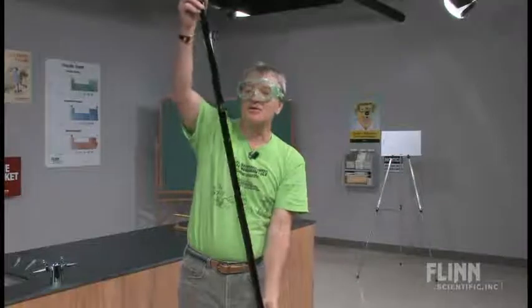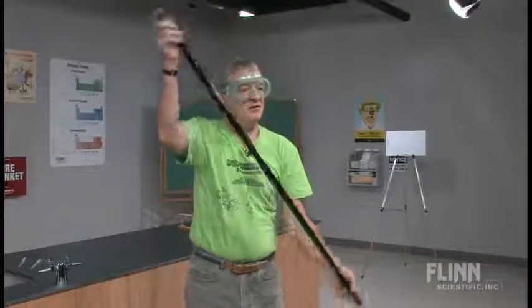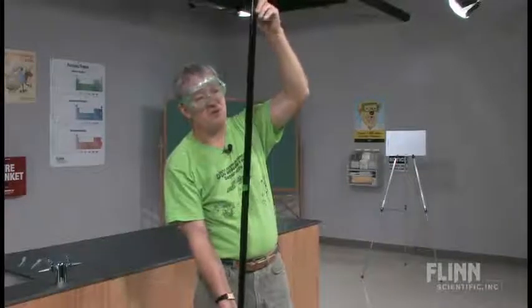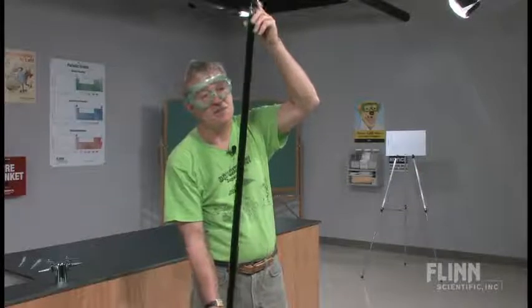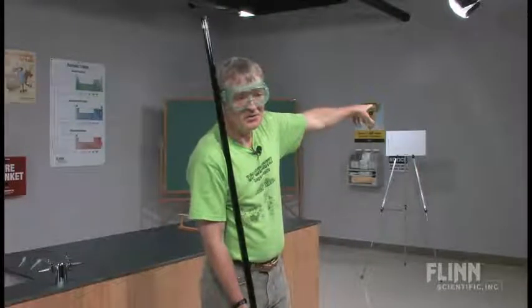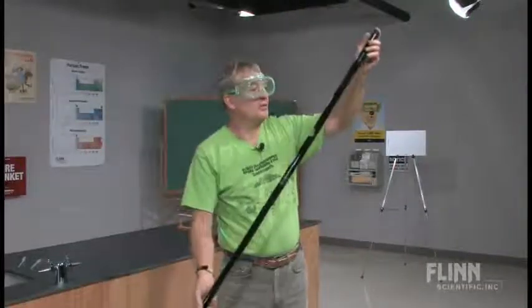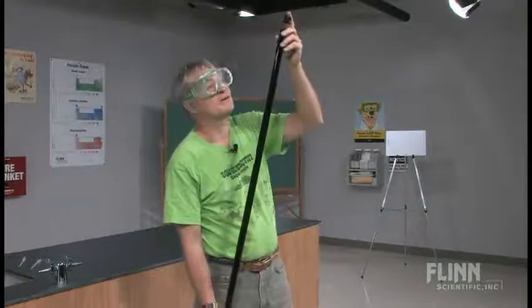On a higher level I can go as far as Raoult's Law and actually challenge my AP students — have them measure the tube, calculate the percentage of each liquid inside, find the mole fractions, use Raoult's Law, and calculate what the pressure should be inside the container. If I want to make it an elegant activity, go back and see if it equals what the pressure sensor levels off to at the end. It won't — Raoult's Law assumes perfect solutions, and just like ideal gases they don't exist — but you've still got a meaningful comparison.